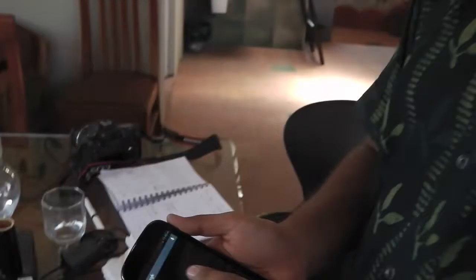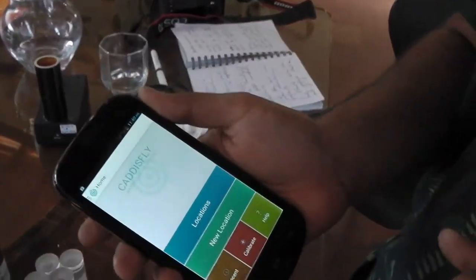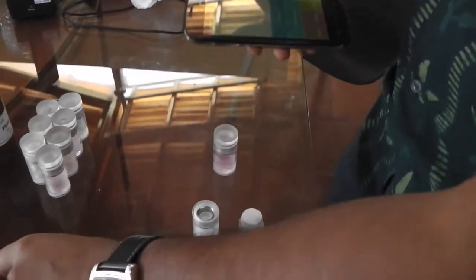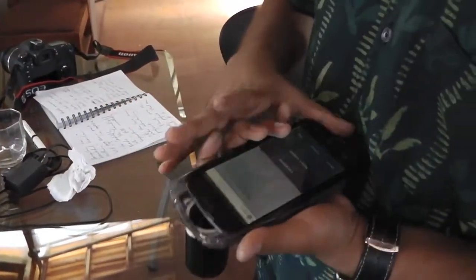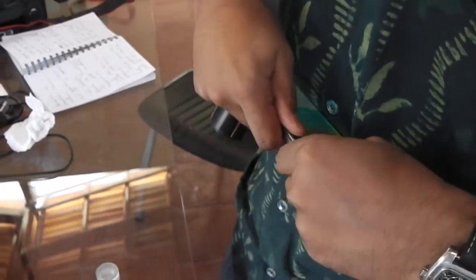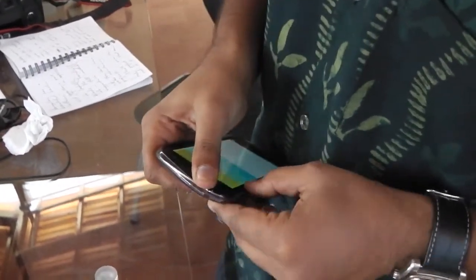The main component of the test kit is your phone, which is an Android phone, and it needs to run the Cadizfly app. Each phone comes with its back case, which has this part fitted onto it to do the test. You fit the case on like so.